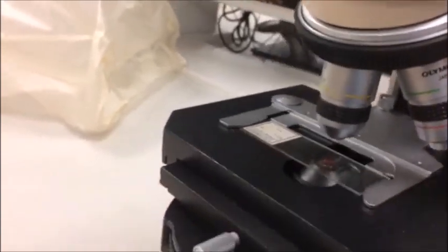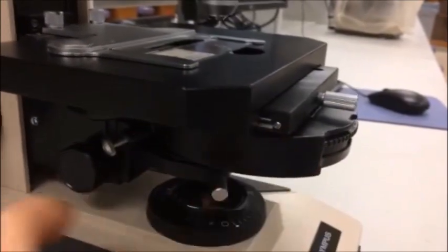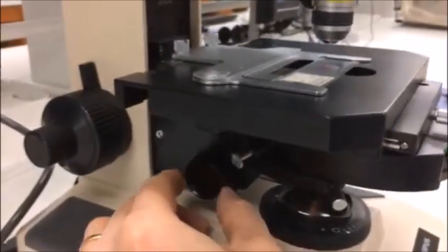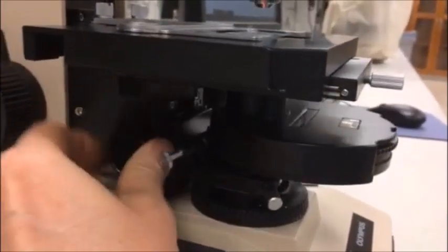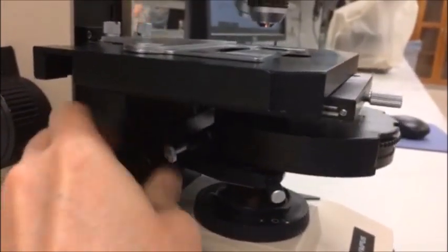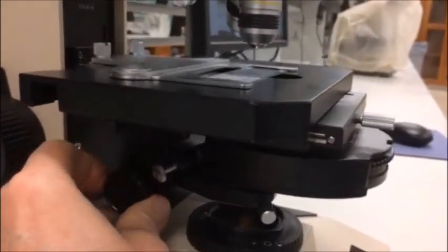There is another part of the microscope, and this is the part that is the trickiest to adjust, and that's called the condenser. So the condenser is underneath the actual stage, and this knob here is the condenser focusing knob. And you'll notice when I turn it, the condenser moves up and down. And this is a major part of the adjustment that is probably the most difficult to do.